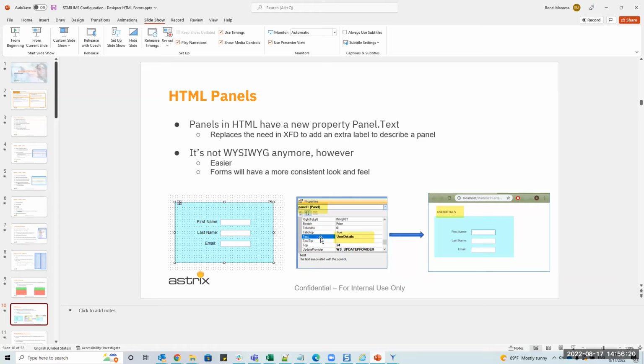Now if you put it into the property, it has a nicer font, like a gray font. It's a little bigger, and it's all caps. Back then, one programmer would do it one way, a different one would do it a different way, and you can lead into various consistency issues. Now if people start using the properties the way they were intended, you get a uniform look and feel.